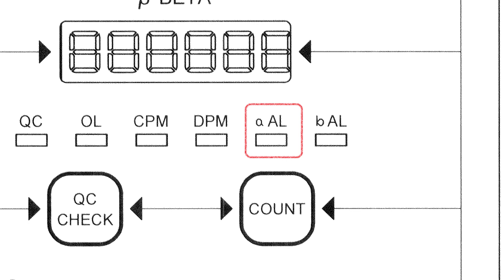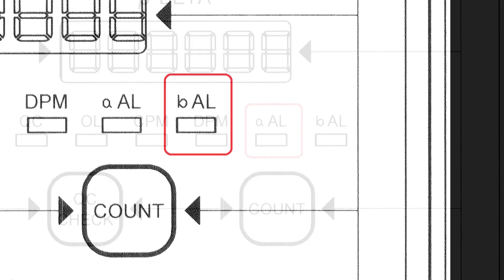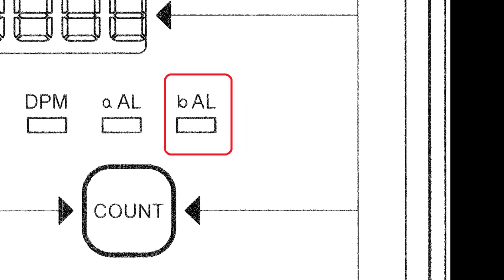An alpha alarm light which is a red LED indicator that illuminates whenever the alpha count exceeds the alarm level. A beta alarm light which is a red LED indicator that illuminates whenever the beta count exceeds the alarm level.